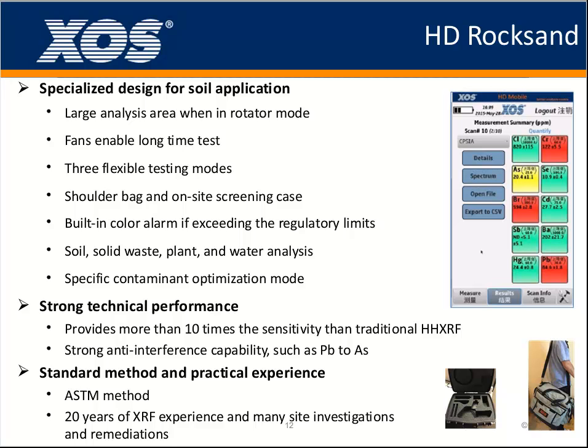As we know, there are many contaminated grounds where lead concentrations are much higher than arsenic, and there will be a spectrum interference between lead and arsenic. For the first generation XRF, it is difficult to process such a problem, but HDXRF can give much better results.